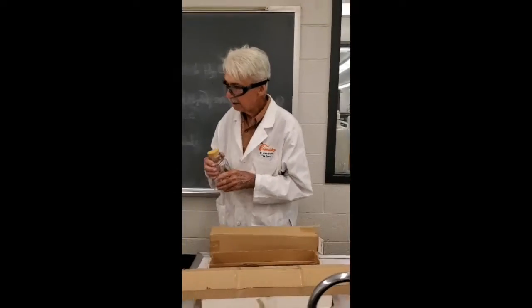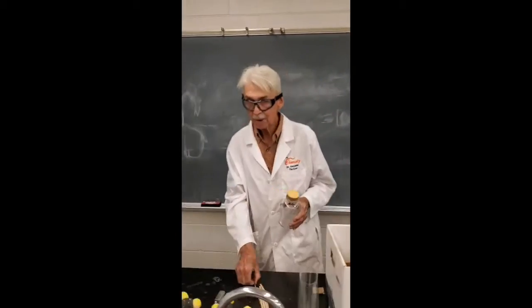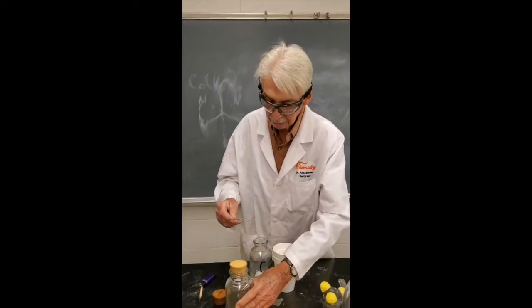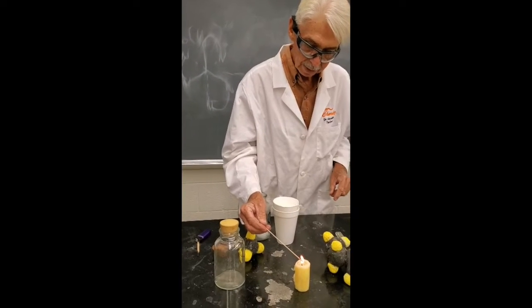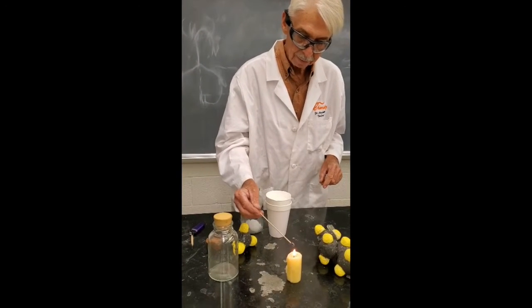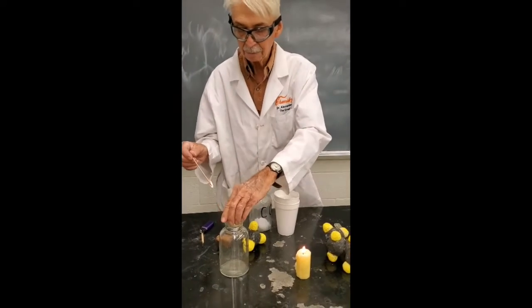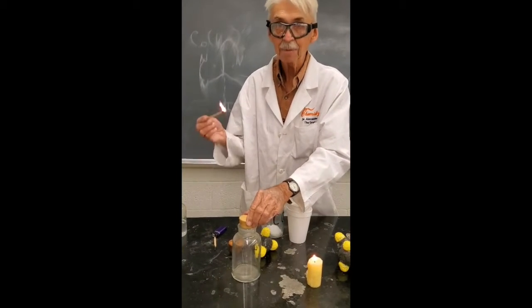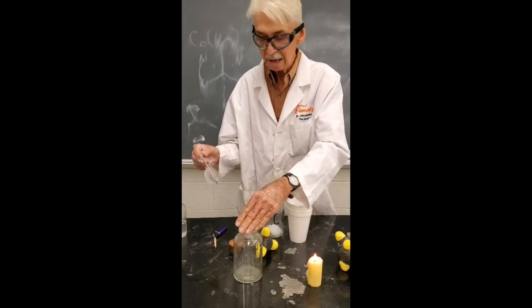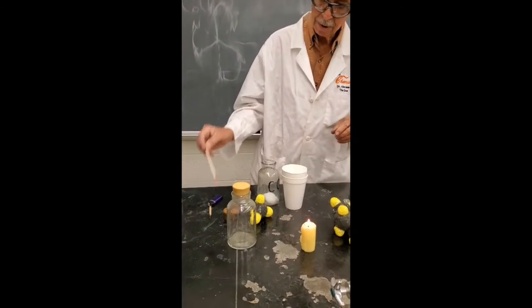So now this one here, I'm going to try to show you that propane will burn. What I'll do is, and it's heavier than air, so I take the stopper out, it should start burning. Let's see. You see it burn? And I put the fire out. Did you get it? Okay. So it started burning, right?